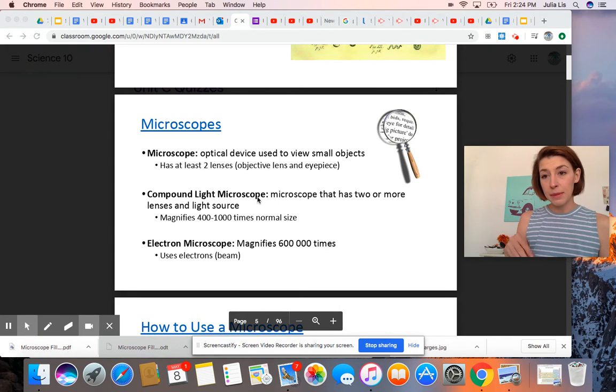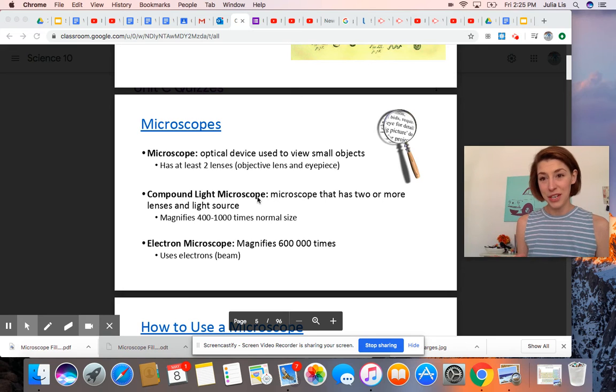They project beams of electrons down onto the specimen, and they produce an electronic image onto your computer. And depending on what kind of electron microscope you're looking at, a TEM or an SEM, you can also look at living species and produce 3D images of the stuff that you're looking at. So it's really cool. These microscopes are very large. They're about the size of you and I if we were standing upright. So they take up a fair part of the room. And they are very, very expensive. But the images that they produce, which we'll look at, are really cool.